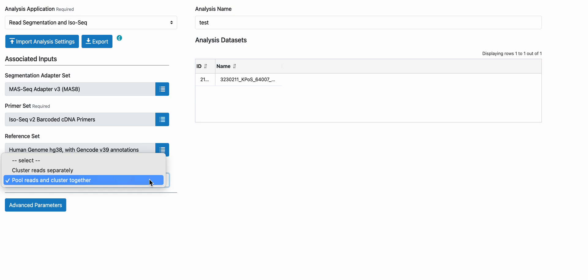Filtering would also be done separately and be output in separate files.